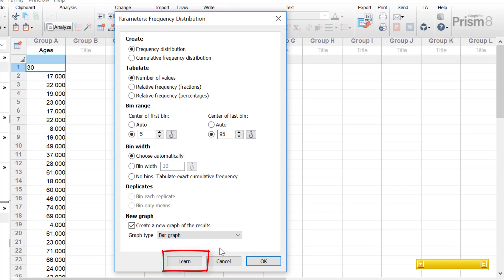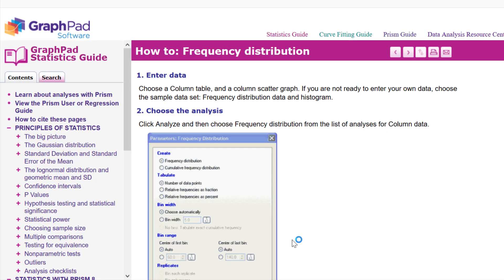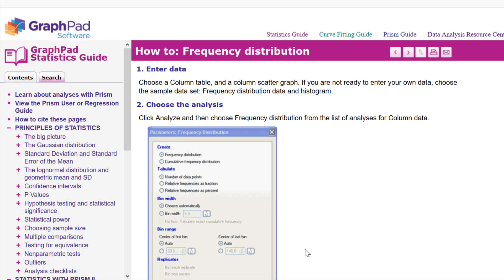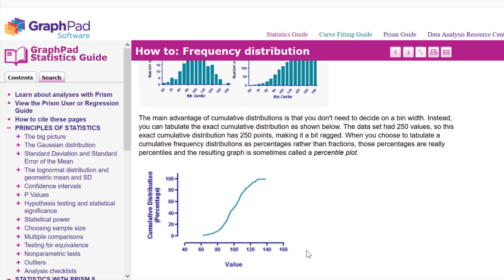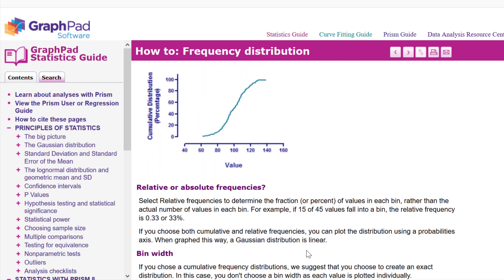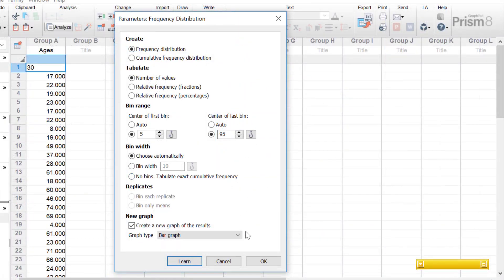Another useful thing to remember is the learn button. Clicking it takes you to the GraphPad website where you can learn more about frequency distributions and the settings we've just discussed in more detail. I definitely recommend clicking this for a good read over the frequency distribution section. So let's go ahead and run this — click the OK button.